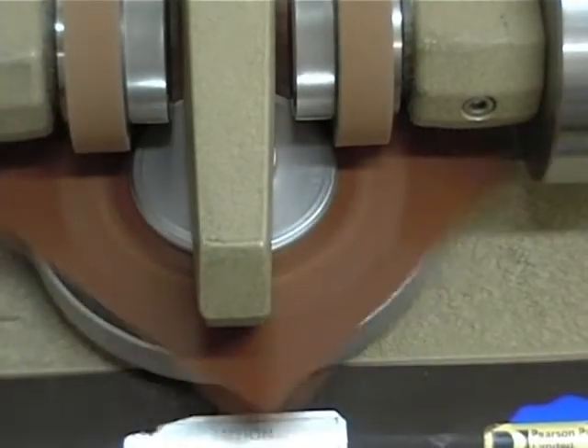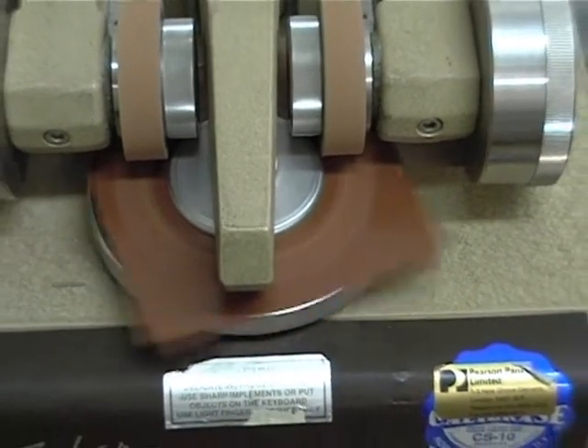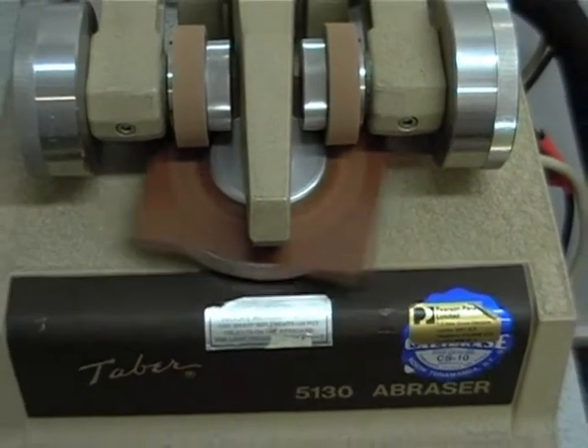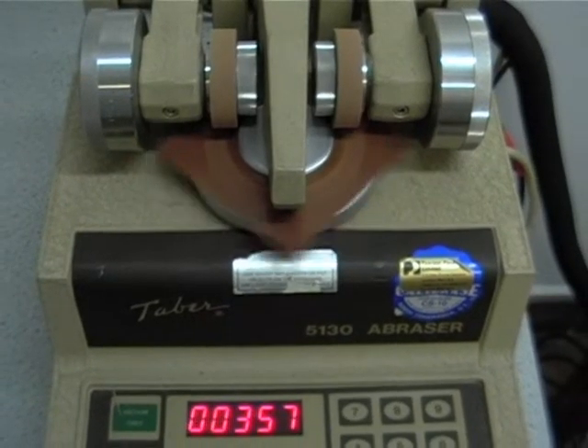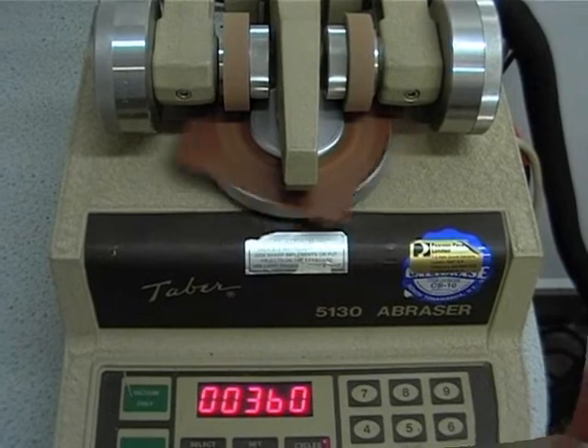This uses a specialist piece of equipment in which a sample is spun in contact with two abrading wheels. Weights on the wheels ensure that a reproducible force is applied, and vacuum suction is used to remove dust and debris.